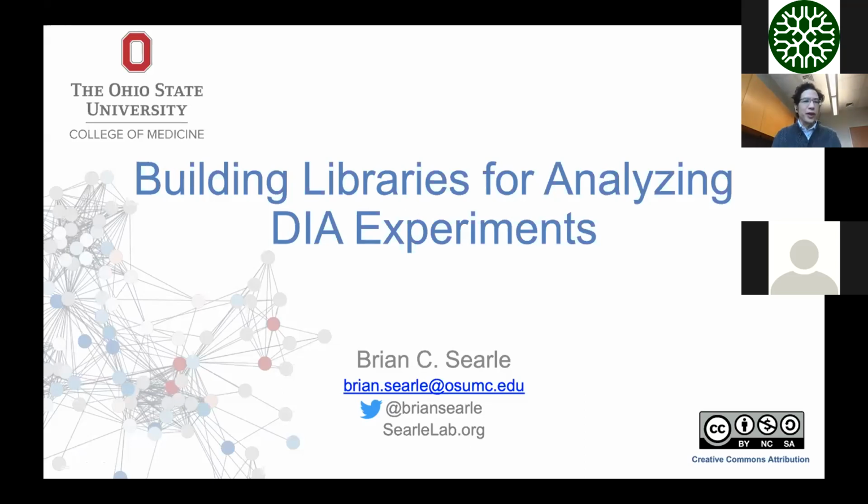All right, so I guess to start, I've been coaching a lot of people through how to acquire data through DIA experiments, and almost always the biggest question that people have is how do I build libraries for analyzing my experiments, and how do I go about interpreting the data that I do collect? Because configuring the instrument is actually probably the easiest part of this.